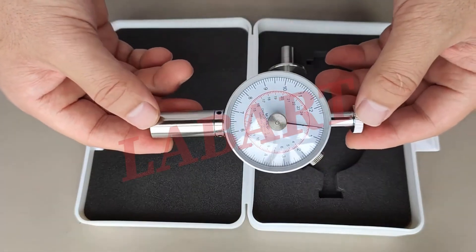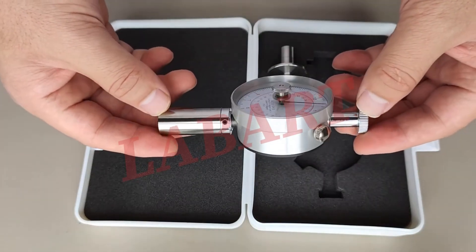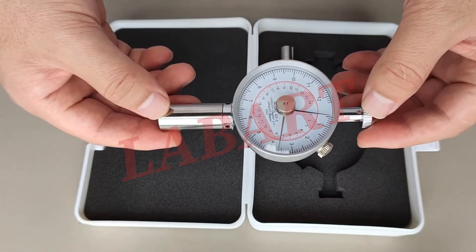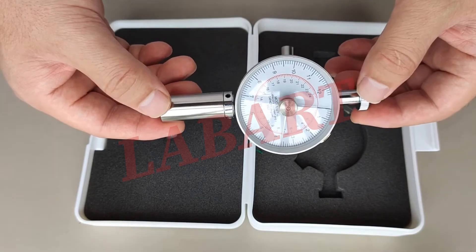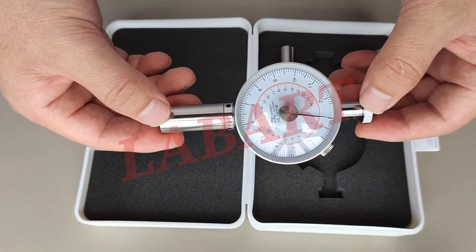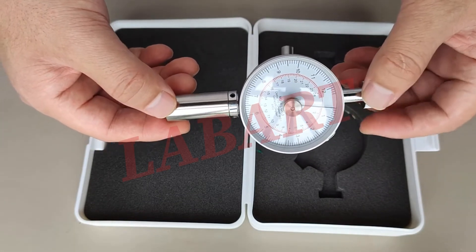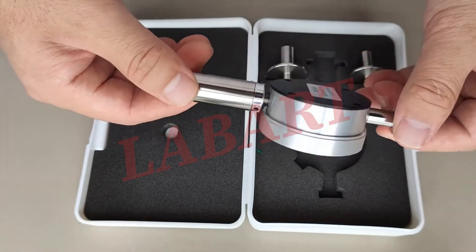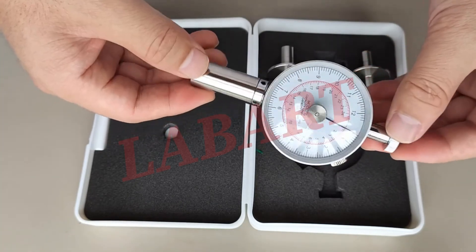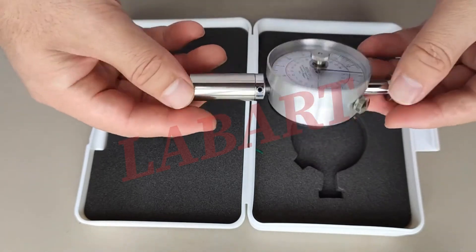Hello everyone. Today I'm going to introduce you to the fruit penetrometer. People also call it a fruit hardness tester or penetrometer. Here, this is the penetrometer.